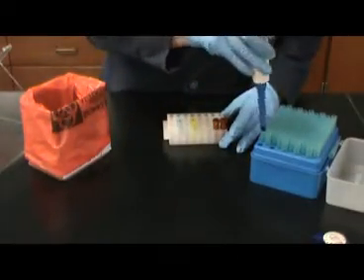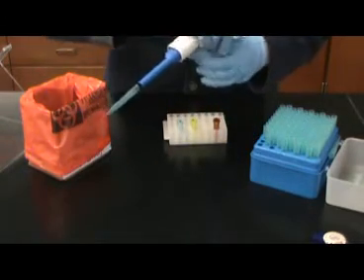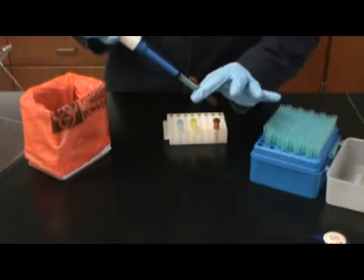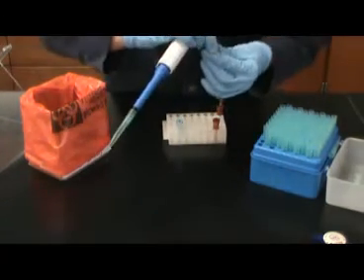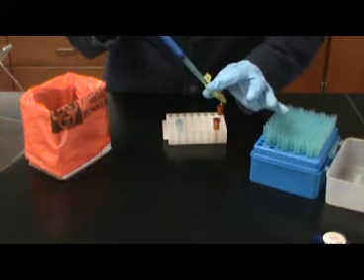Remember, the pUC18 plasmid contains a gene for ampicillin resistance. This means that those organisms or cells that appropriately took up the pUC18 plasmid will begin transcribing and translating it as part of its normal genome. This will instill ampicillin resistance in those bacterial cells.